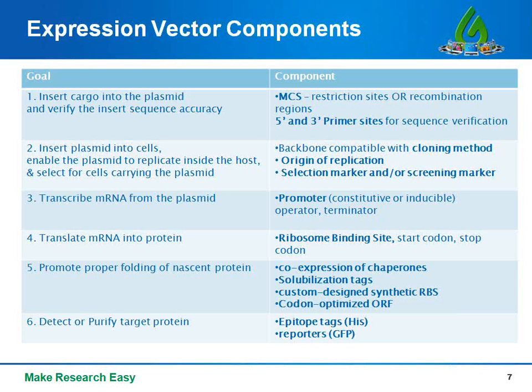So this is most often done with the help of restriction enzymes, which recognize specific cleavage sites. So the region of the vector where you will insert your gene of interest contains a lot of different restriction enzyme recognition sites right in a row. This is called the multiple cloning site, or MCS. There are other cloning methods which require special vectors containing recombination regions or other adaptations, and I'll discuss those a little bit later.